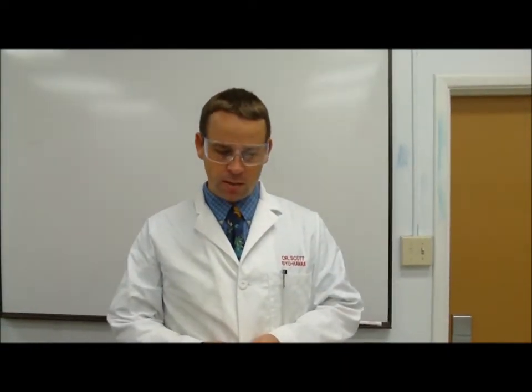Alright, so this video is of me making up solutions of different volumes and different concentrations, and looking at different ways to express concentration. That way, if you're ever in need of making up a solution, you can go to this video, identify the section which pertains to the type of concentration you're trying to make, and hopefully follow the process and determine what you need to do.